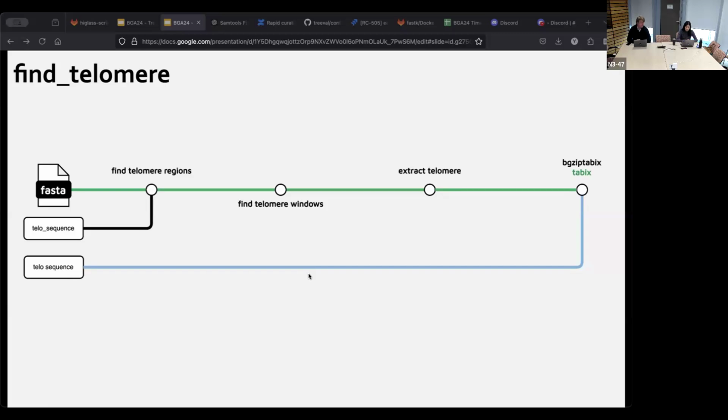5 telomere is straightforward and very simple, and telomere annotation is an essential part of genome curation, as you know. It provides valuable information about the structural organization of the genome. By identifying telomeres, we can pinpoint the approximate location of the end of each chromosome or scaffold, which is very important to understand genome integrity and structure.